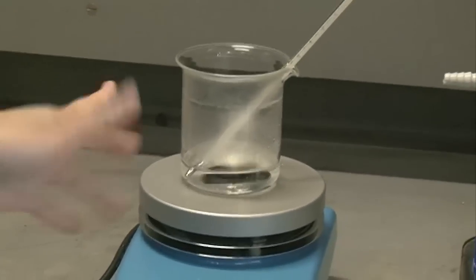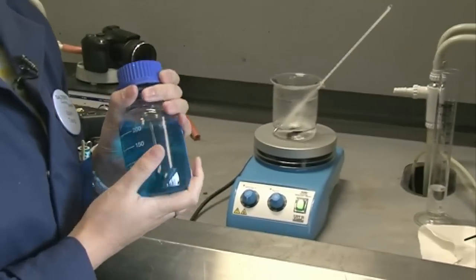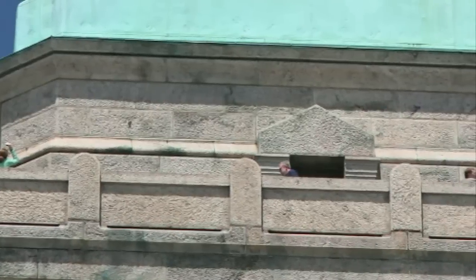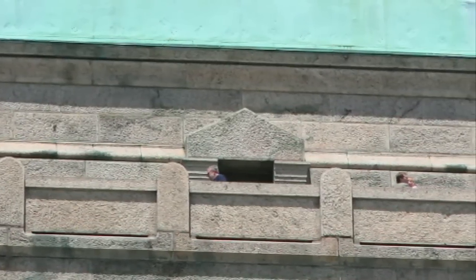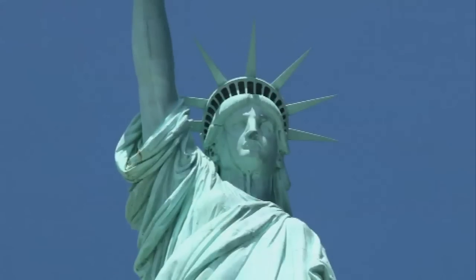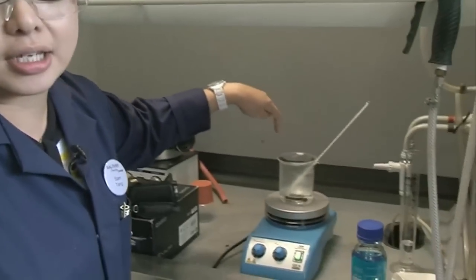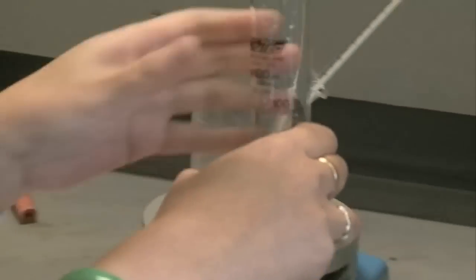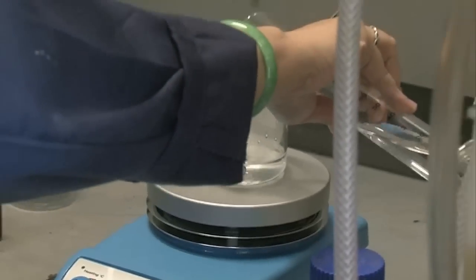Inside the beaker we've got a solution called sodium potassium tartrate, so no copper in there at the moment. We're going to introduce that through a solution of copper sulphate. We need to heat this to about 50 degrees C, and to the sodium potassium tartrate we need to add some very weak hydrogen peroxide — this is only 3% hydrogen peroxide. So in it goes.